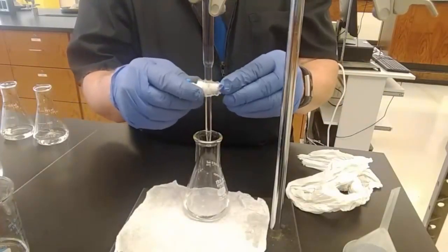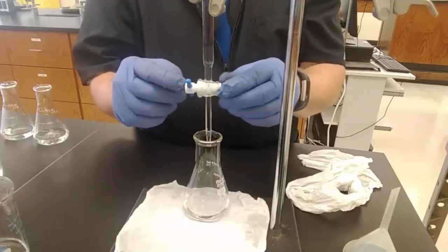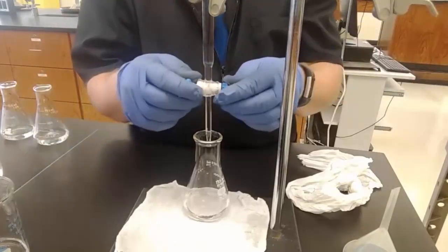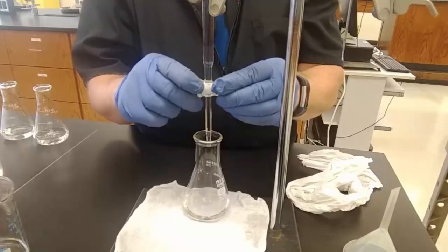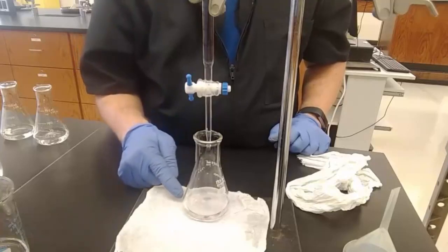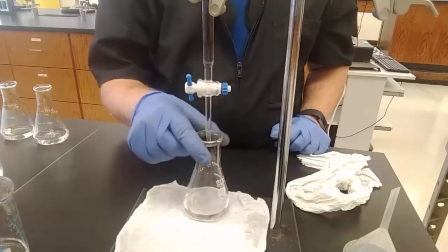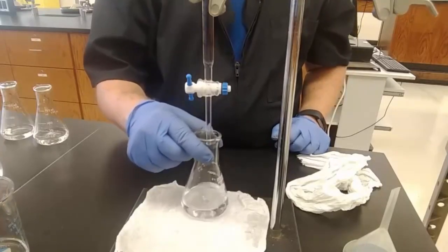Now, I am paranoid just from back in the day when these things used to not be made out of silicone. They were made out of glass. And occasionally, they would pop off, and then everything would go all over the table. It's annoying. So I like to hang on to both sides at once. But this doesn't give you a hand to stir with, so I can get it going. You might be able to see right as it hits, it turns pink. Because locally, all the acid and the base have reacted, but not globally. So I've got it dripping out.